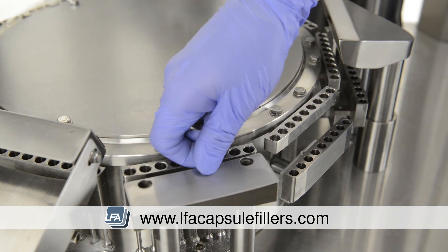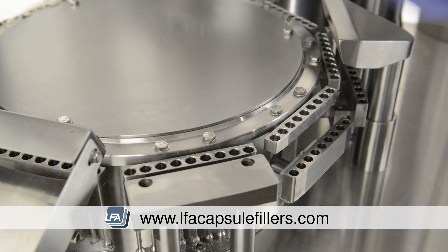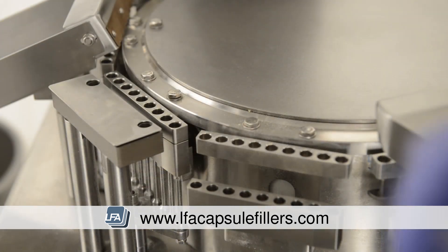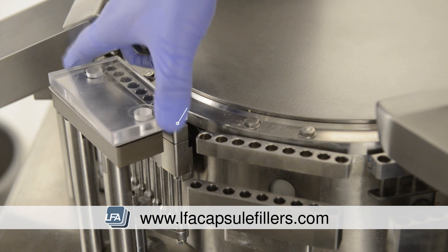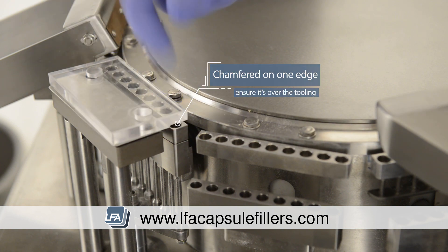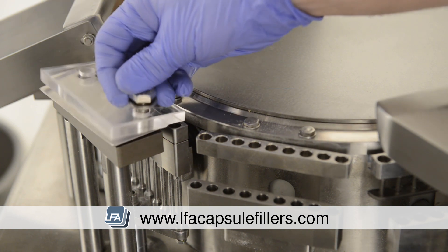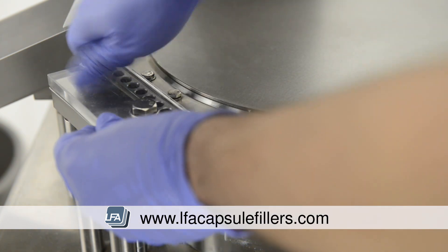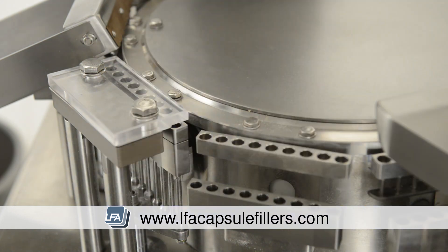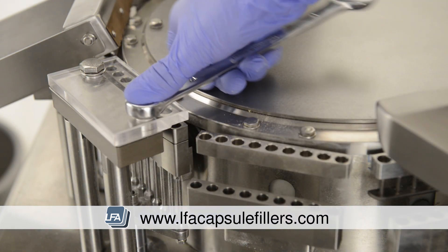When all the stations have been changed we can replace our capsule closing plate. We must first place the small metal plate back into place. The capsule closing plate is chamfered along one edge — this edge needs to be over the tooling as seen here. Place the bolts back into place and tighten finger tight first, then tighten equally with the spanner.